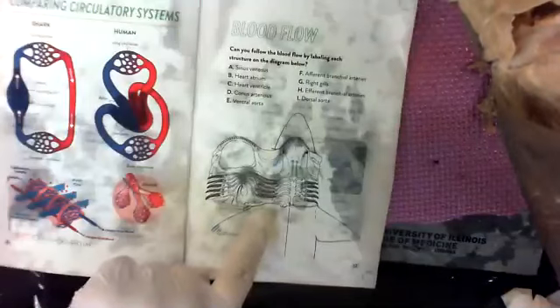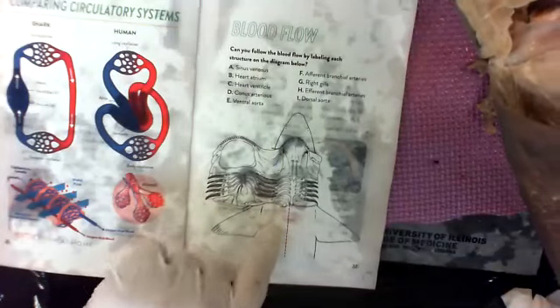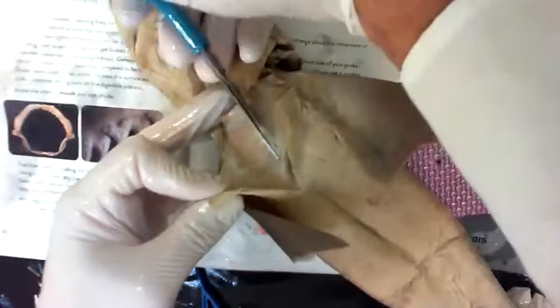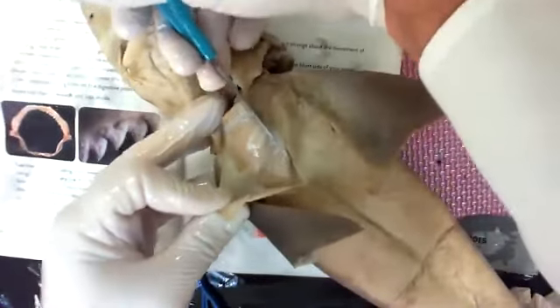Now we're going to cut the abdomen open. There's an image. Oops. We just flipped away from the image. So right here, you can see the dotted line. If you cut right down the, this is called mid-sagittal. Sagittal going right down the belly, almost like it was designed with that line for you to cut. Mid means right in the middle of it. So I'm going to cut, snip. I can feel bone, or sorry, cartilage, snip.